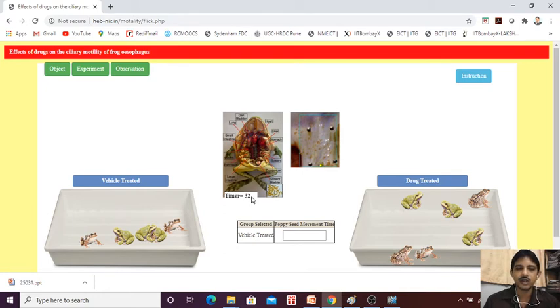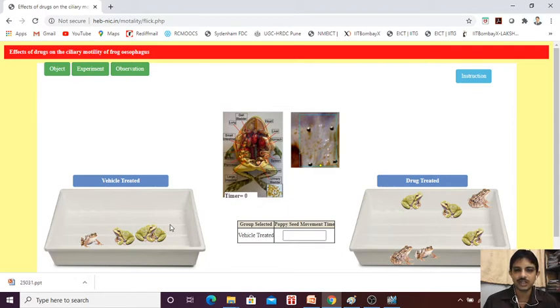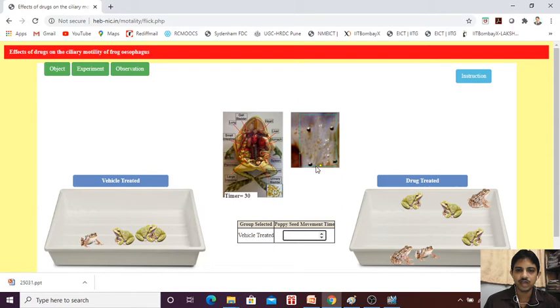We need to find the time. For example, if I am just clicking — start it — and within, for example, 30 seconds, it was reached to the end.